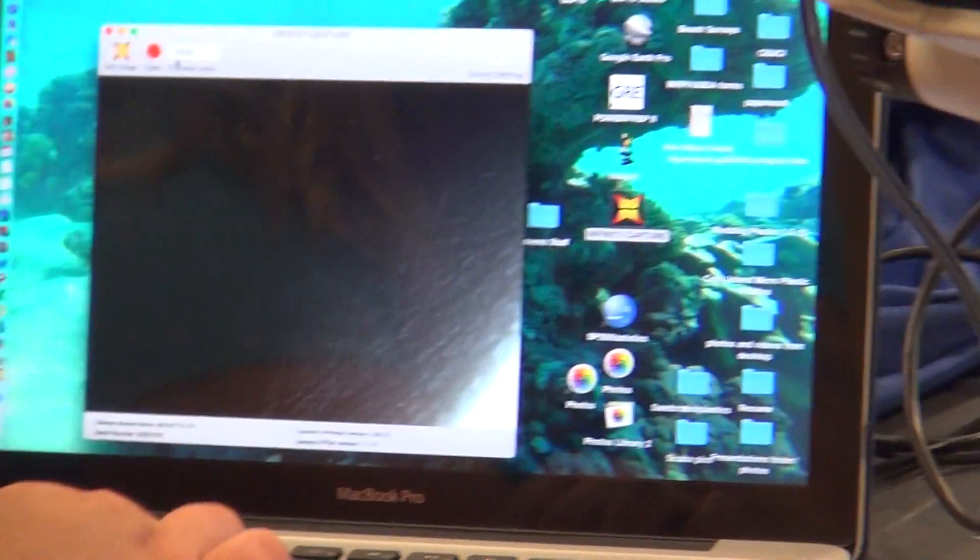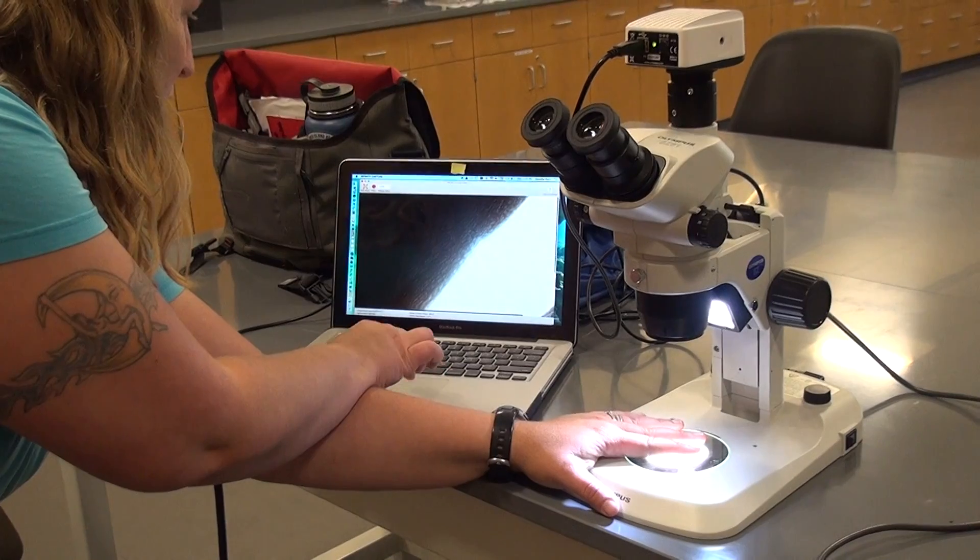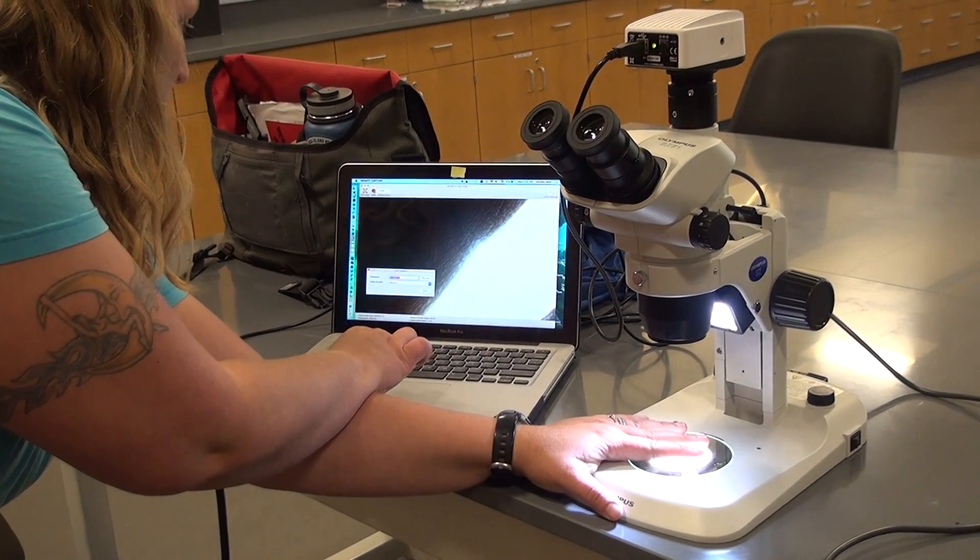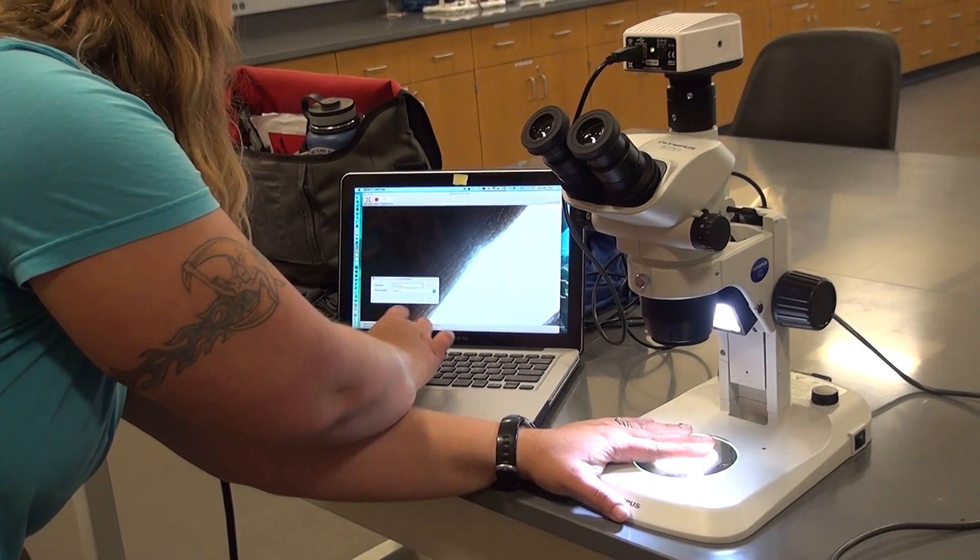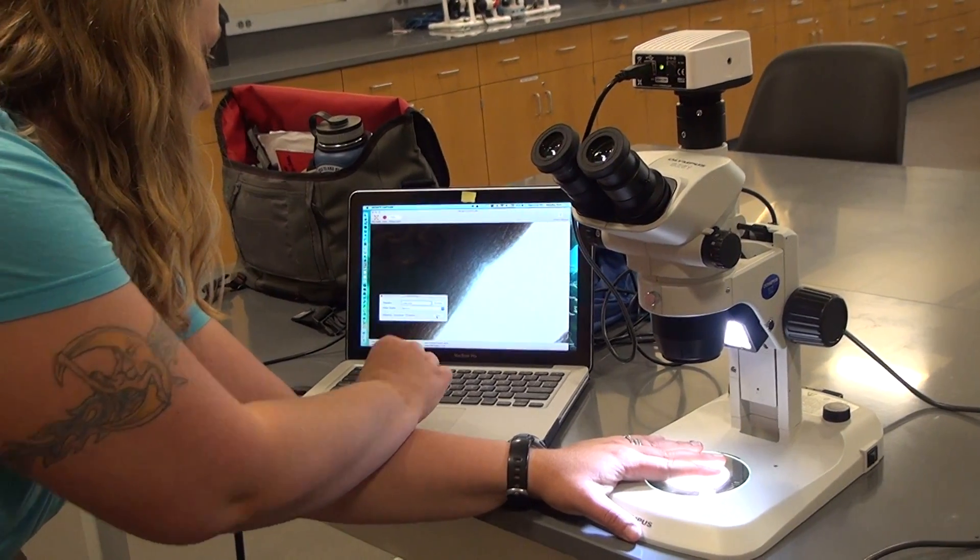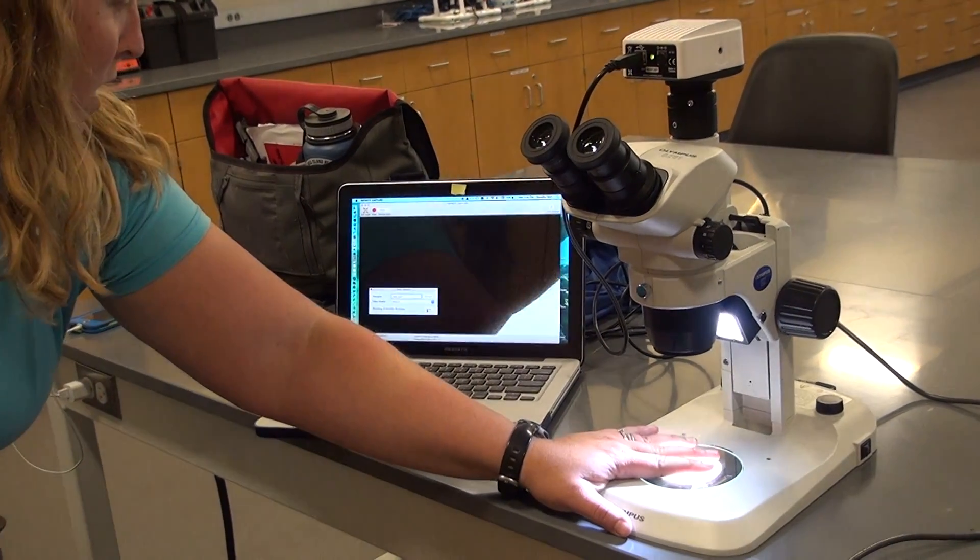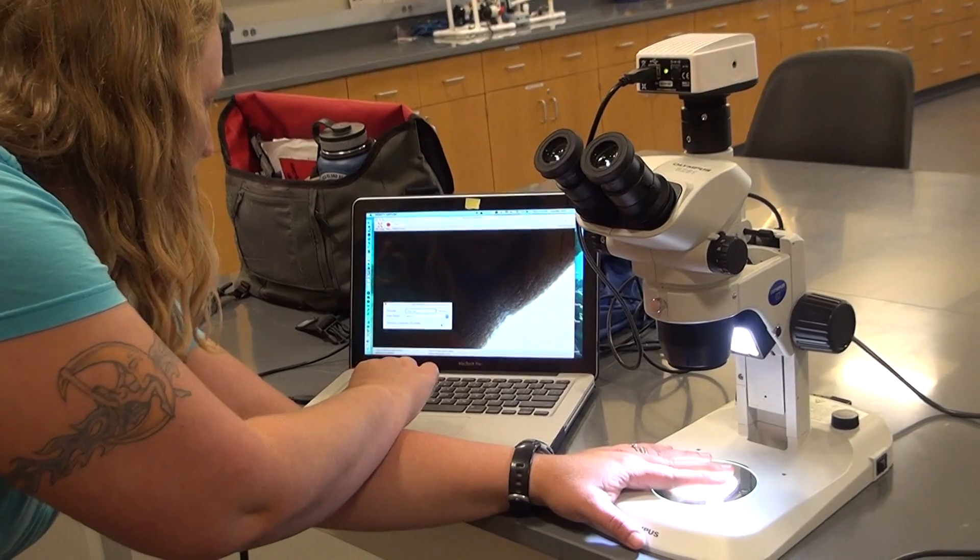You can also video. So say you're dissecting something, or you have something alive on your camera. You click video. Then you have to name it. Test. And then you have to click start. And so now it is videoing my hand moving around, or say a worm, or whatever you want. Then you click stop.